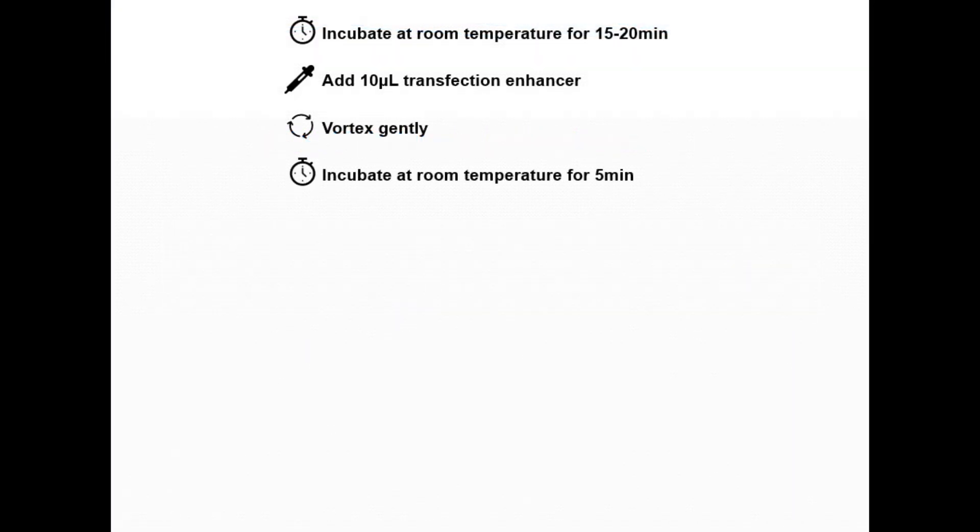Next, incubate the mixture for 15 to 20 minutes at room temperature to allow complex formation. Then add 10 microliters of transfection enhancer reagent, gently vortex, and incubate for an additional five minutes at room temperature.